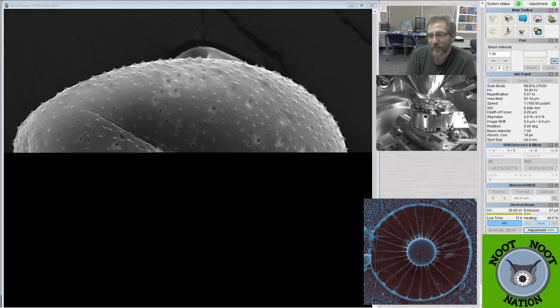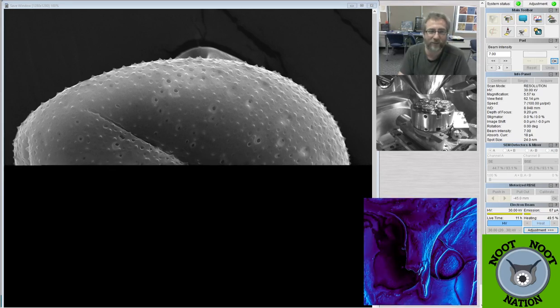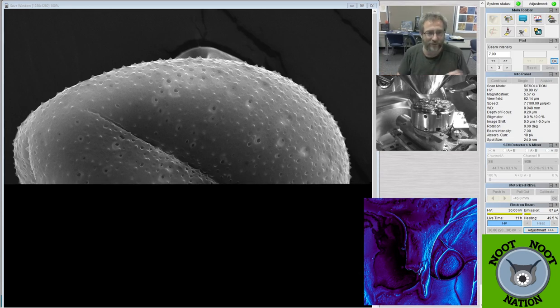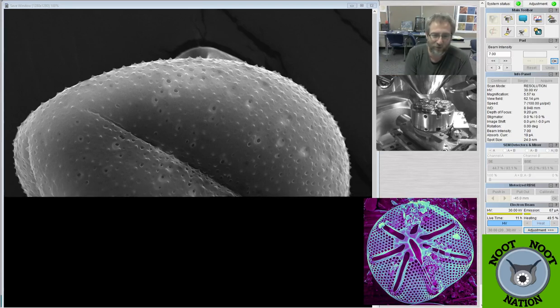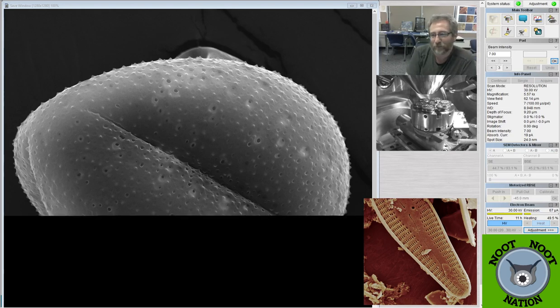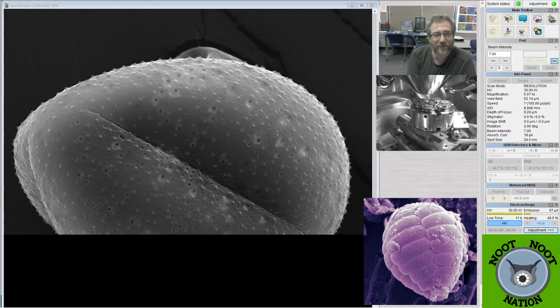But the SEM just has a special feel, because you can zoom in to any level. Whereas for the light microscope, you have gates, right? Like a 10x, a 40x, a 60x, a 100x gate that you can see things through. But with the SEM, you just pick, and then the closer you zoom in, the bigger it gets. So in that sense, it's kind of cool.